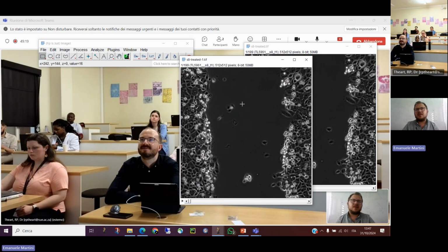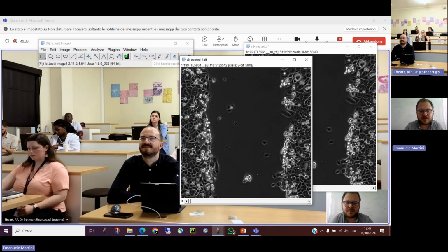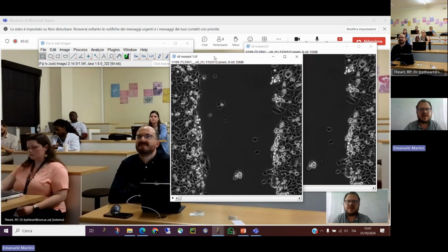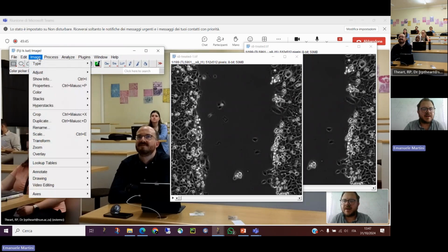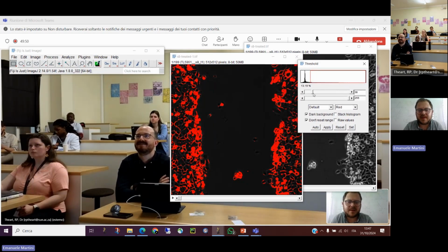So here you have to think what I've seen in these 2 days that can help me to identify the cell layers against the wound. So we want to find a way to segment these areas, and not this area, I mean, segmented cell layers. Usually when you start with something like that, you can say, I want to try some thresholding, no? If you see here, it's a little bit harder to find a thresholding directly, no?